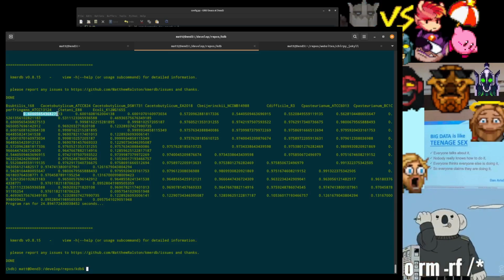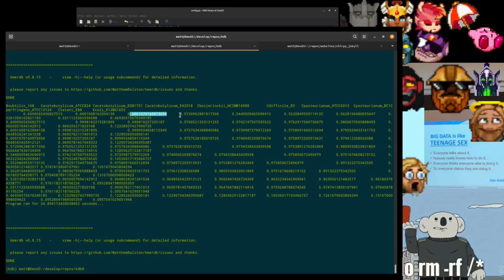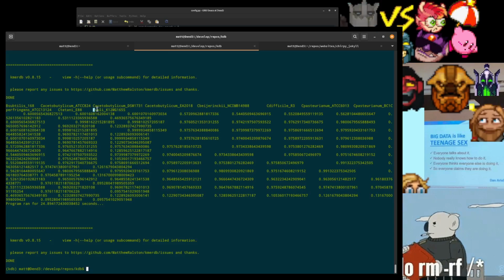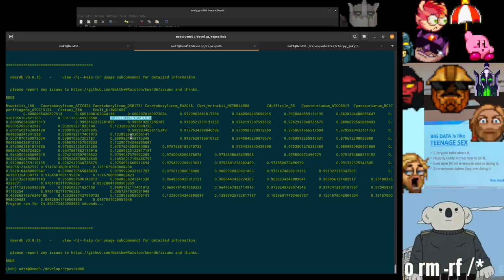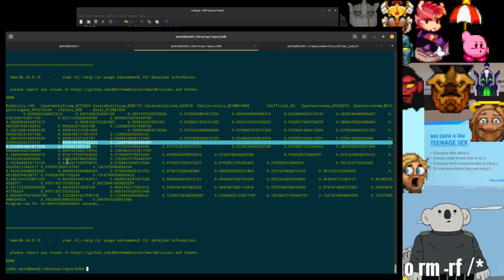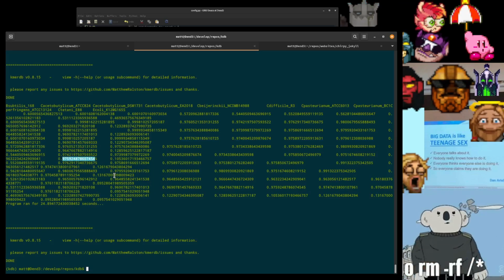This would be B. subtilis to other C. acetobutylicum strains, other Clostridia. They're more distantly related. Last column is E. coli, so that one's this. It's down to 0.46, so it's much more distantly related. The C. acetobutylicum strains and other Clostridiales are all very similar to one another in terms of their kmer count profile.